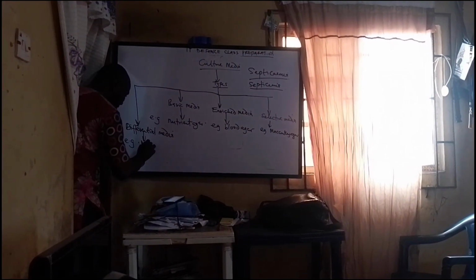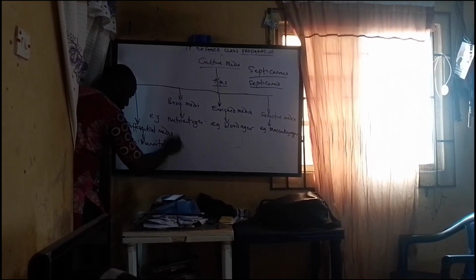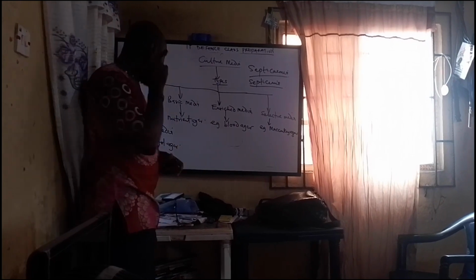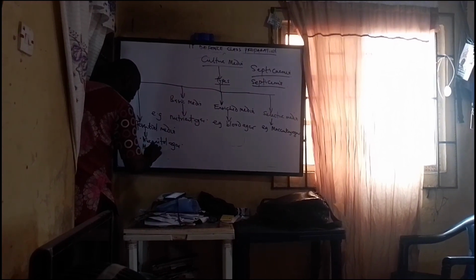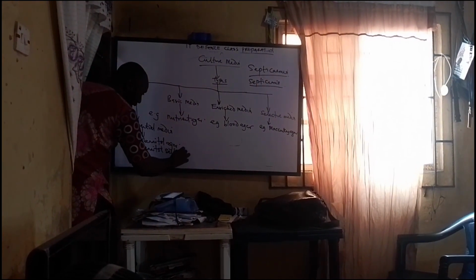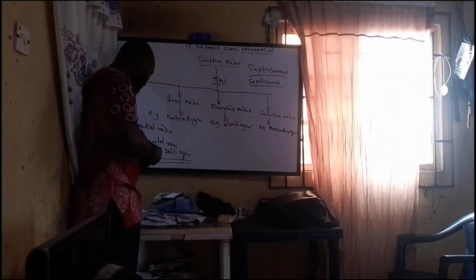For example, we have mannitol agar. There's another name for it. Please, you can write mannitol salt agar. This one is preferable for me. Mannitol salt agar.